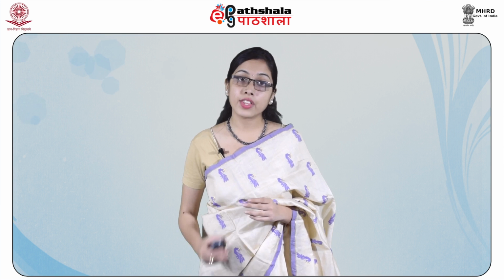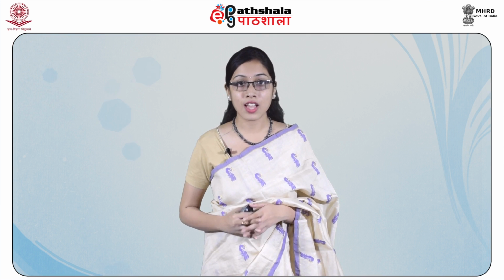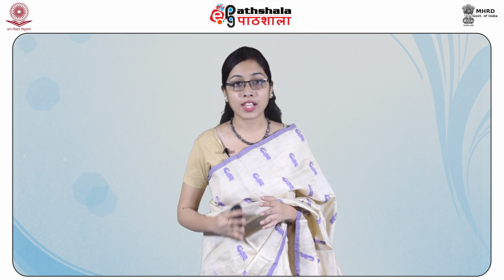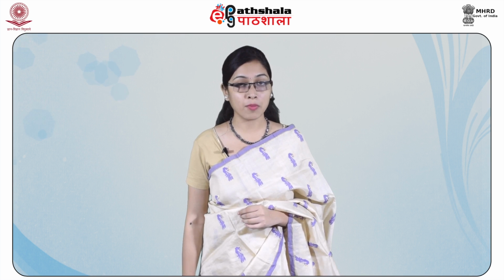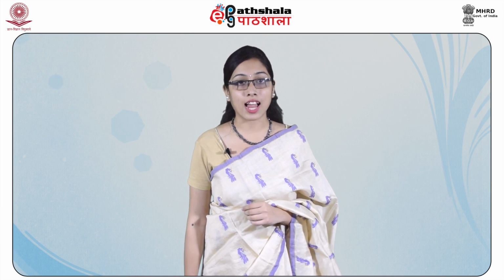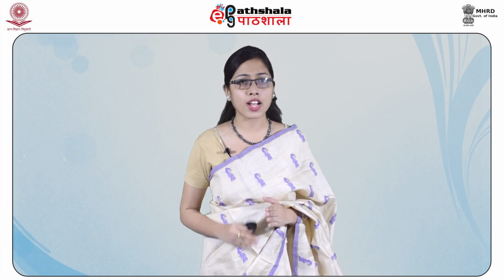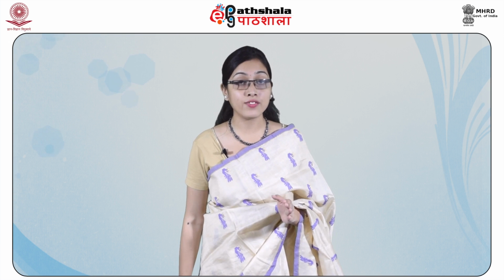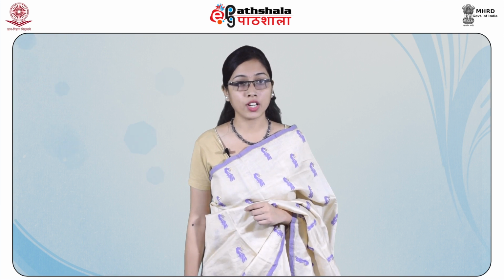The history of chromatography dates back to the early 1900s when a Russian scientist, Michael Tswett, successfully separated a mixture of plant pigments using calcium carbonate and alumina packed in a glass column. In his experiment, he made a solvent extract of homogenized plant leaves and applied this extract onto the calcium carbonate column.